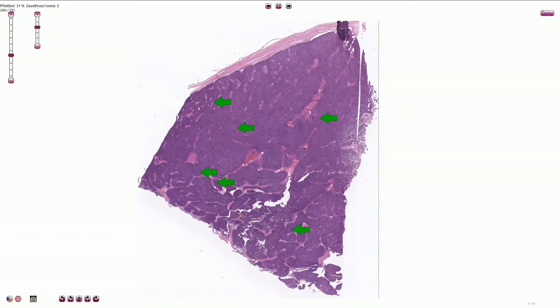Nephroblastoma or Wilms tumor is a malignant embryonal neoplasm derived from nephrogenic blastemal cells. It is often associated with multiphasic patterns of differentiation. It typically occurs in children, and small children around two or three years of age are the most commonly affected.